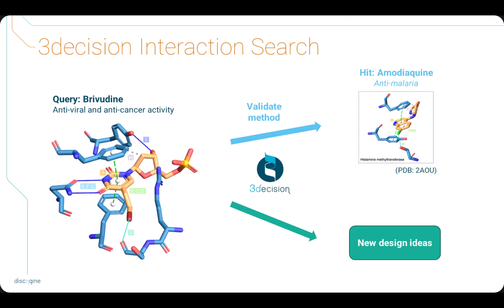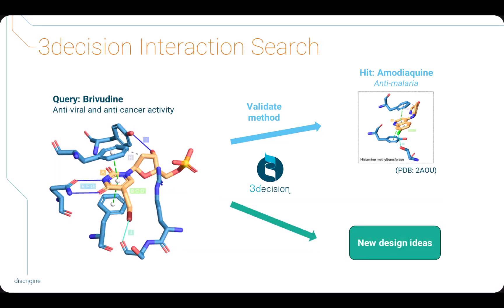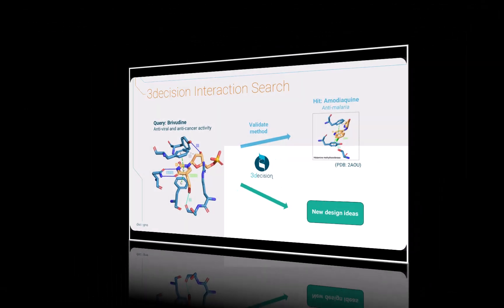We will reproduce the results of this paper using the 3Decision Interaction Search, to validate our method for the drug repurposing use case. We will also run a second search to find new ideas for ligand design.